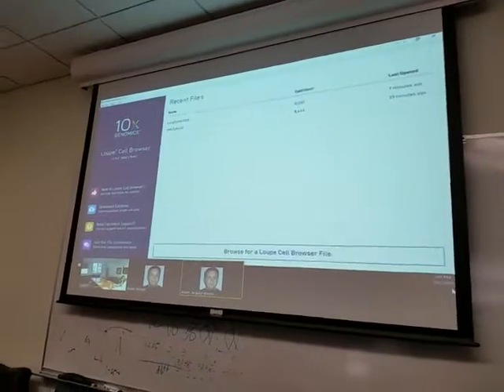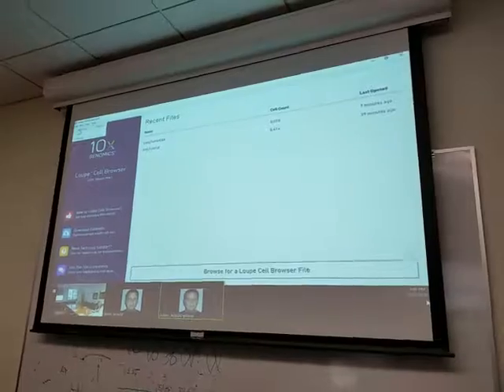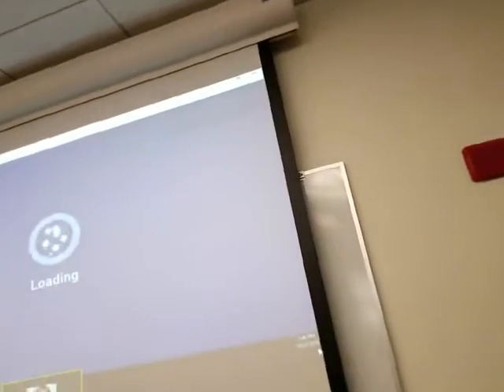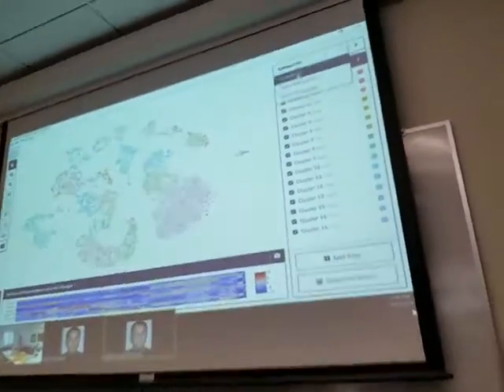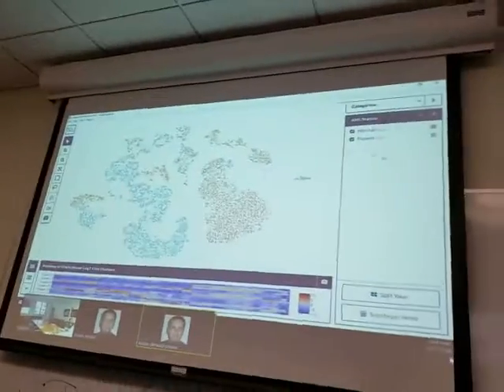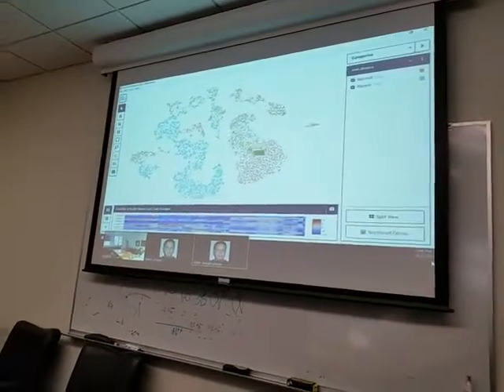I don't think that's probably the right strategy. I think you would want to compare the apples to oranges. So I'll just show you this data set that comes with it. This is actually a pool of an AML patient in blue and a healthy individual in orange.